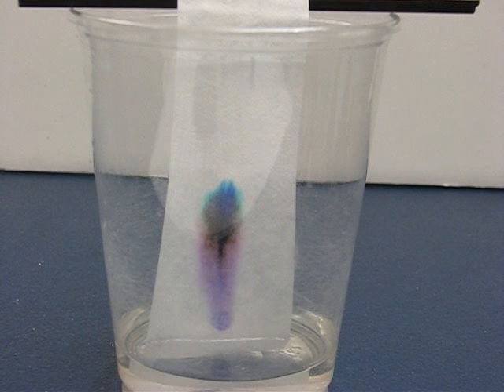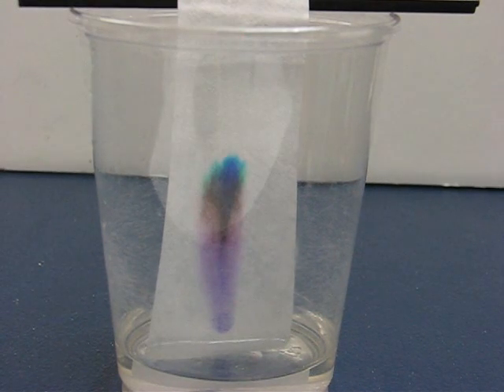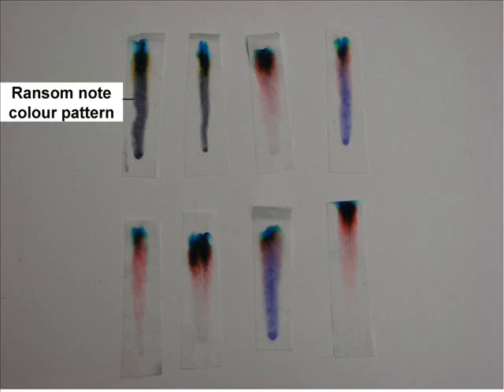We then tested one of the dots on the ransom note and compared the pattern it created to the one we had done in class. We found a perfect match between Mrs. Glenn's markers and the one that wrote the ransom note.